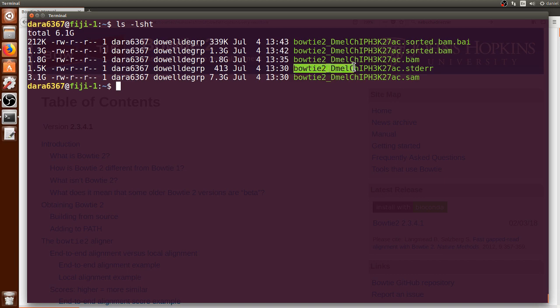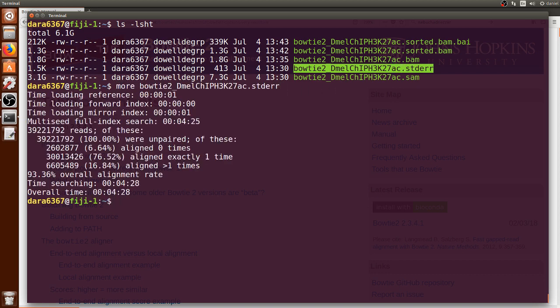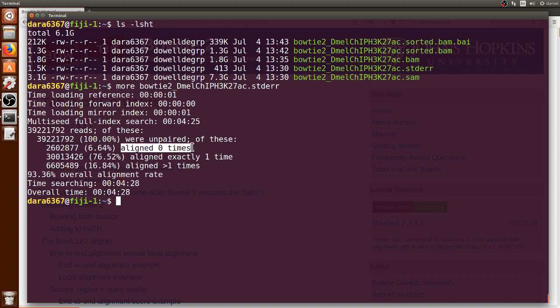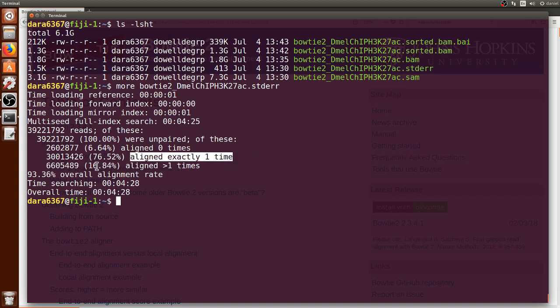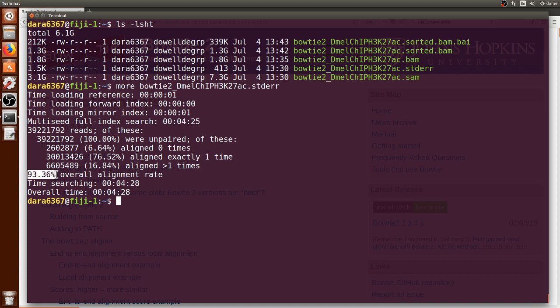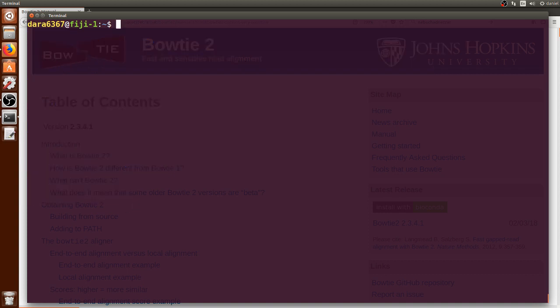And then finally an index dot BAI file was created which was much smaller which is necessary for visualization of the sorted BAM file. Before visualization of the data let's look at this standard error file using more which contains useful information. We can see that from the 39 million reads around 6.6 percent of them could not be aligned at all whereas 75 percent of them were aligned exactly once and 16.8 percent were aligned more than once. Overall we had like a 93 percent average alignment rate which was pretty good.